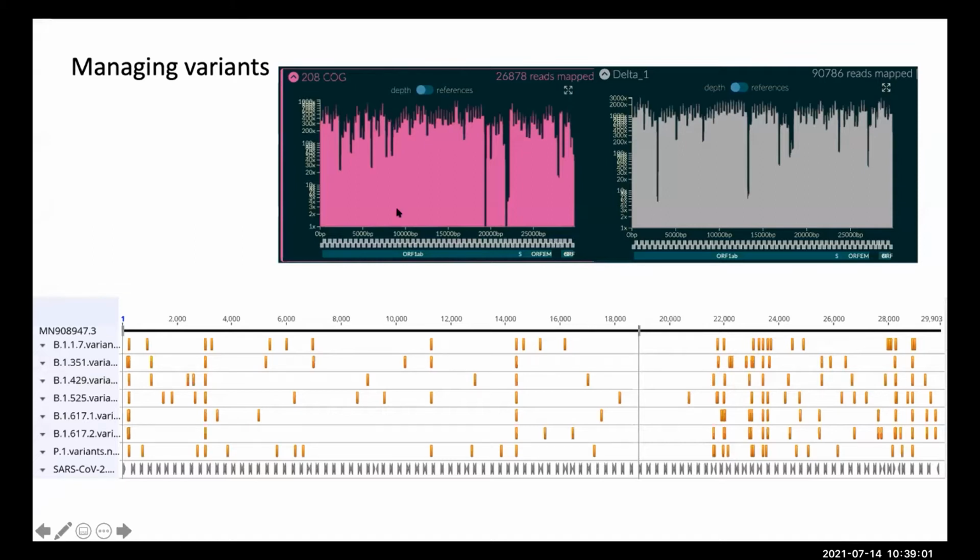So for example, here, this is version three on the left here in pink. This is a rampart plot showing what happens if you sequence a delta variant sample using V3 primers, and you can see that there's 1, 2, 3 almost complete dropouts, where there's less than 20x coverage, which is what we need for the pipeline. And this is only 26,000 reads, but you can see that these two are never going to recover, because we've got no reads, over 26 out of 26,000. This region has reduced efficiency, but it's probably still going to work.